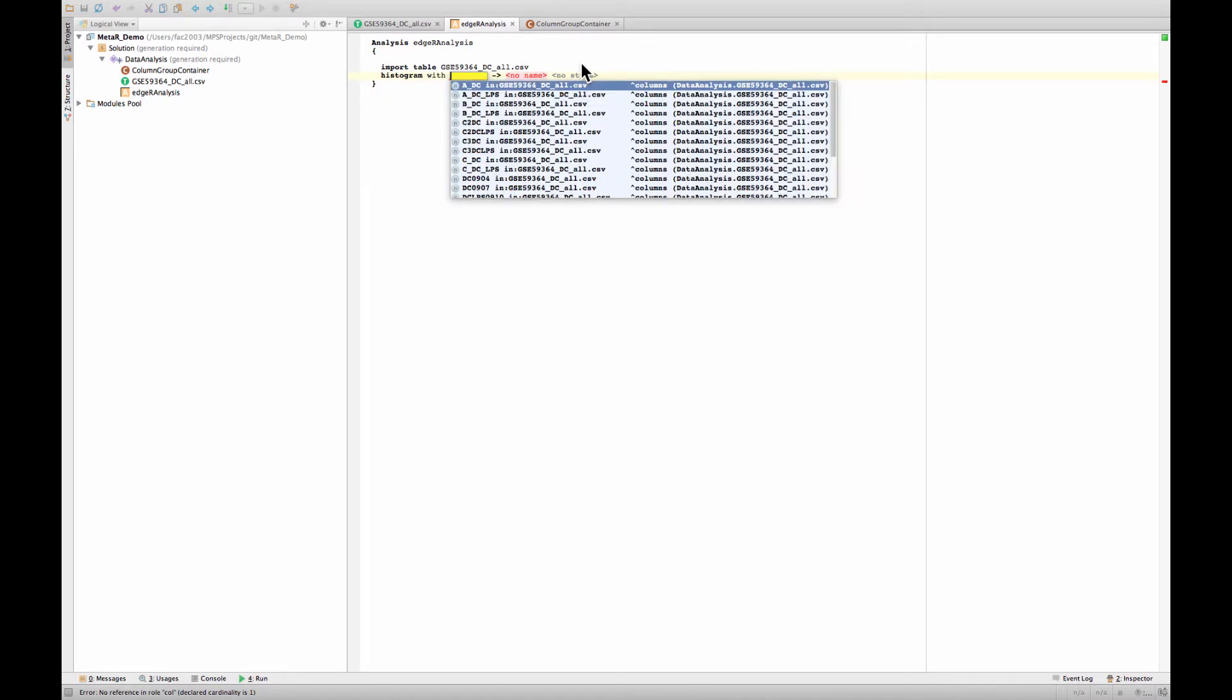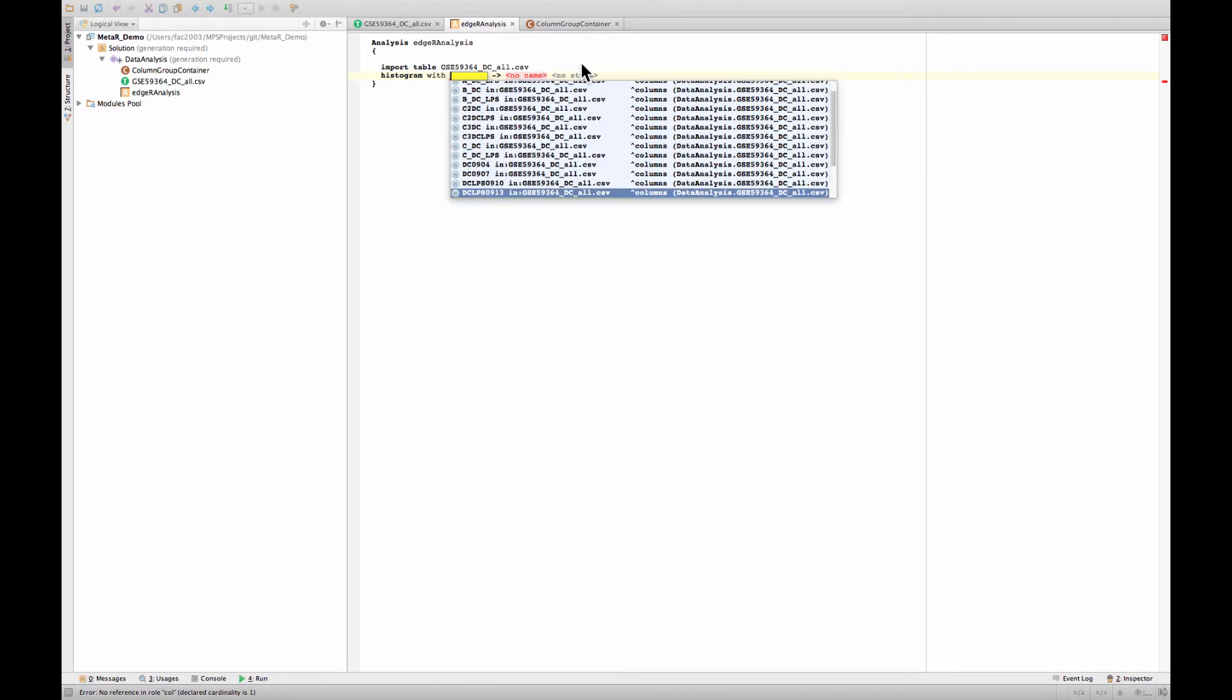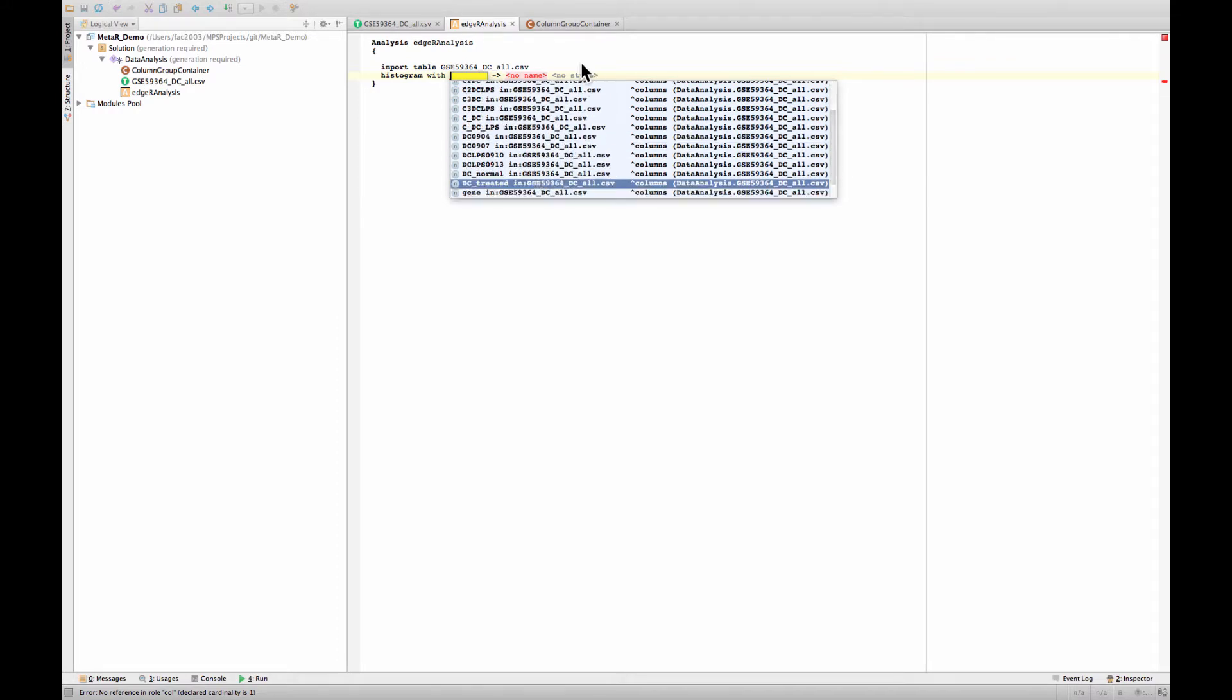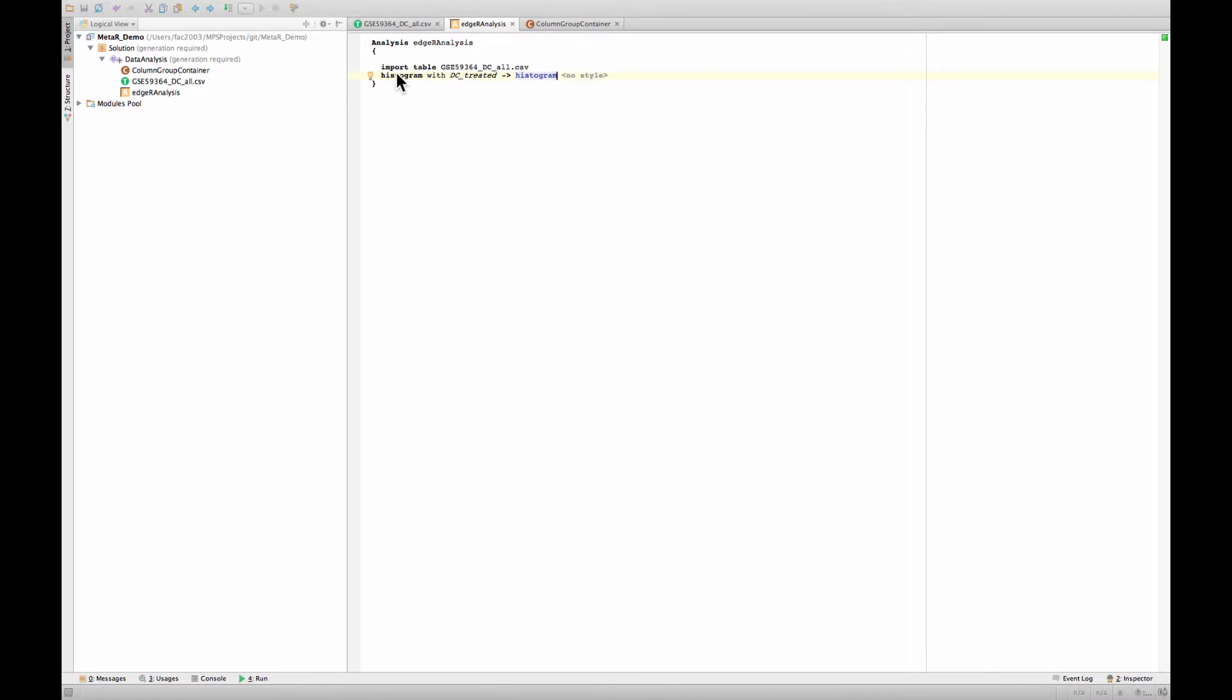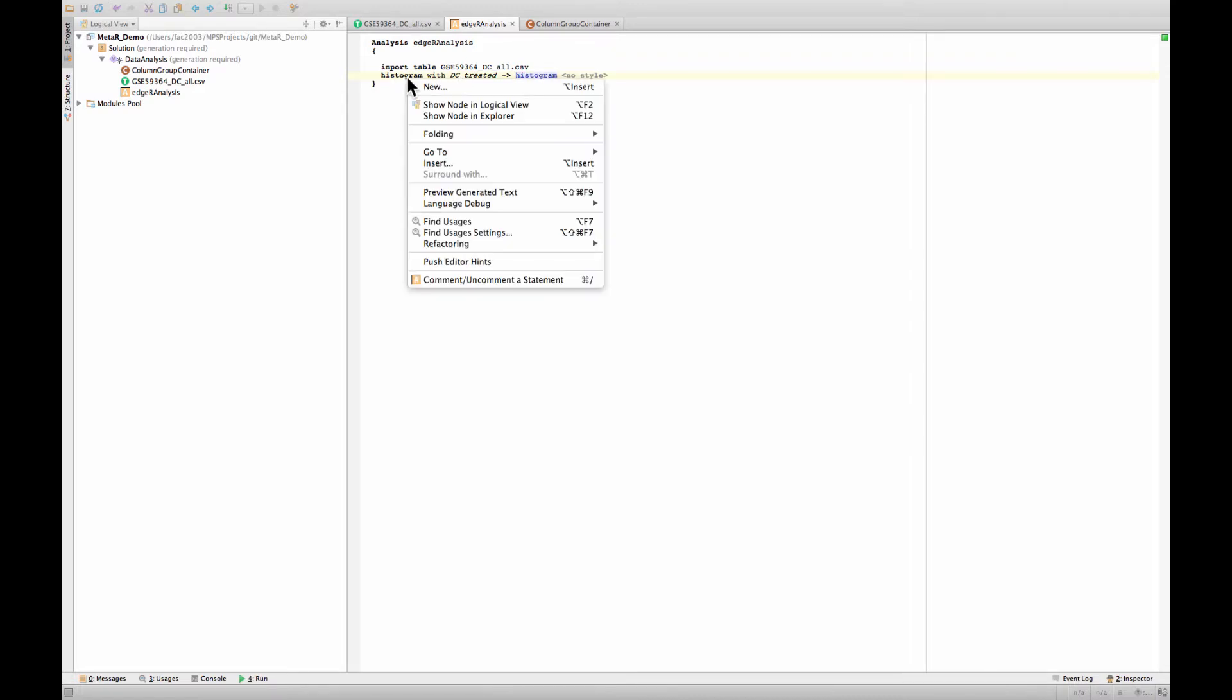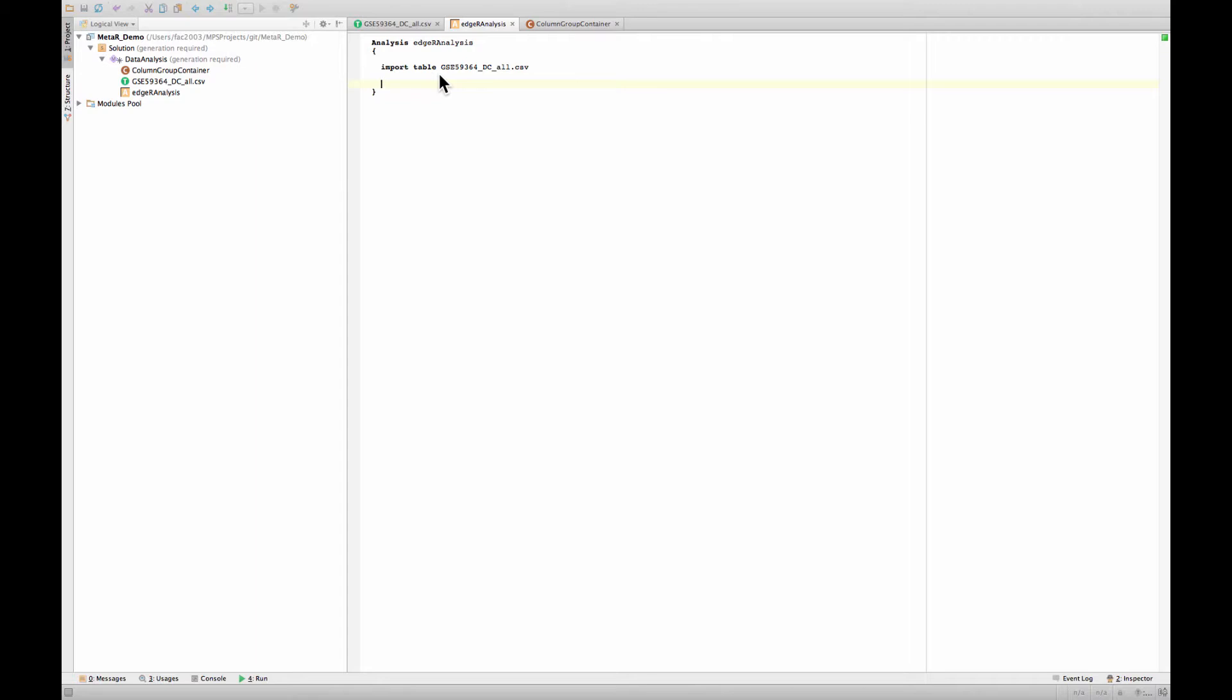After we have done that a number of things happen. We now are able to use the table. Let's say we wanted to do histogram. We now have access to the columns inside this table. We can just very quickly build a histogram of DC treated for instance. This would give us access, we would create a plot. We are not going to do this now.